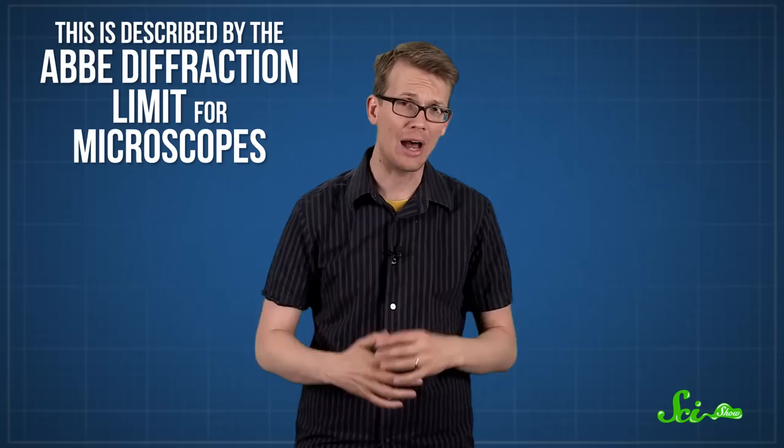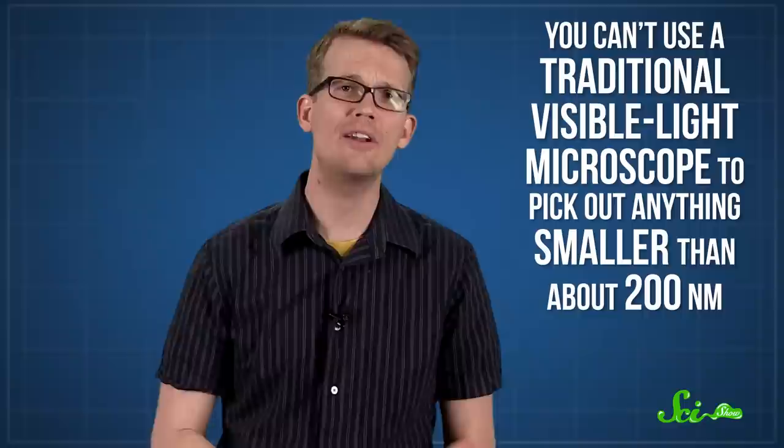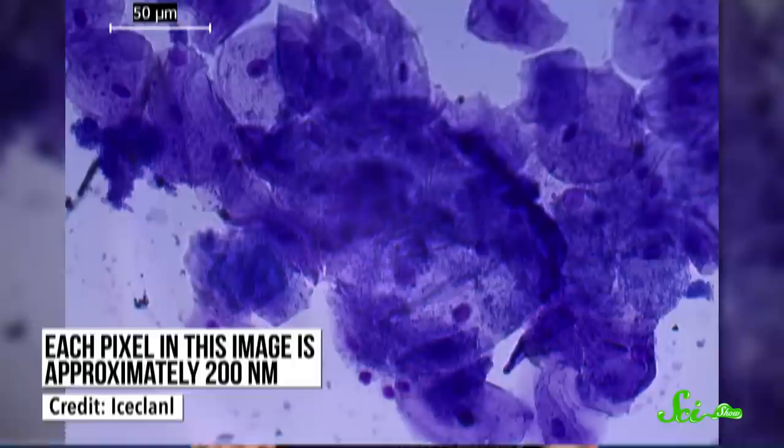So you can't use a traditional visible light microscope to pick out anything smaller than about 200 nanometers, or billionths of a meter. And that's an issue for any scientist who wants to see something really tiny. A biologist, for instance, wouldn't be able to see anything much smaller than the largest structures in a human cell, and biologists really want to know what's going on in there.